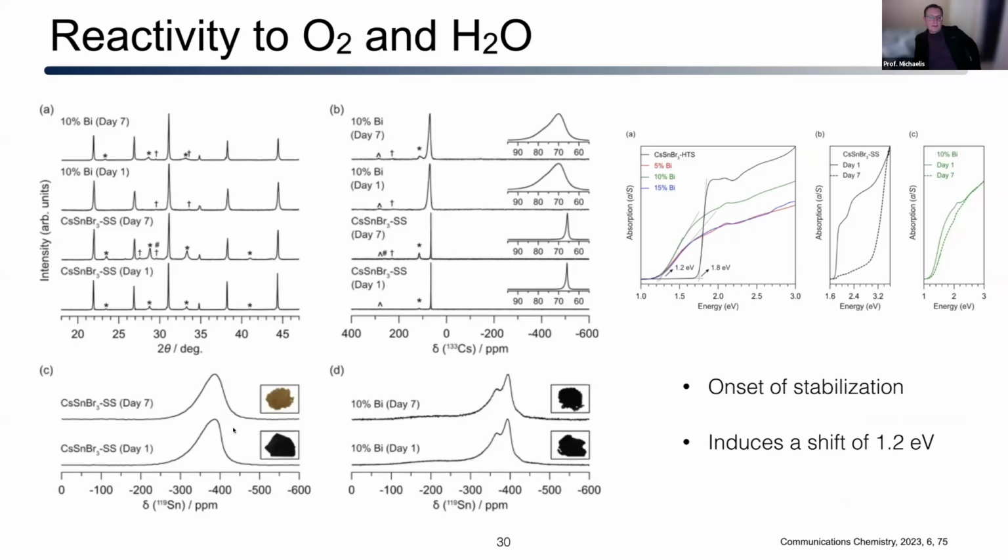Okay, so what ends up happening in this particular case, if I remember correctly, and if I'm wrong, Madhu, I apologize, I believe you still have residual cesium tin bromide. So you have the same chemical shift, but what we don't show you is that way over here, about minus 2000, we also form the cesium 2 tin bromide 6 phase.